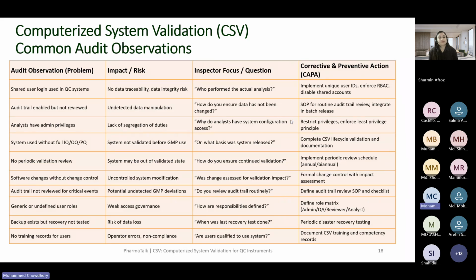And yes, QA can create the recipe if there are no other options. But my recommendation is, in this case, to discuss with the vendor to upgrade or change this privilege group. I think vendors could change these things.